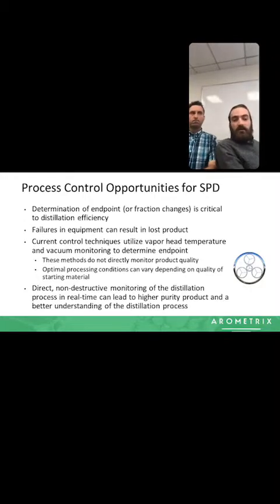The problem with using color changes with your eye is, one, it's subjective. Everybody's got different eyesight, and everybody has different metrics for what the color change needs to be. So this is a massive quality control problem. Additionally, it's not very precise. You don't actually know molecularly what's going on.